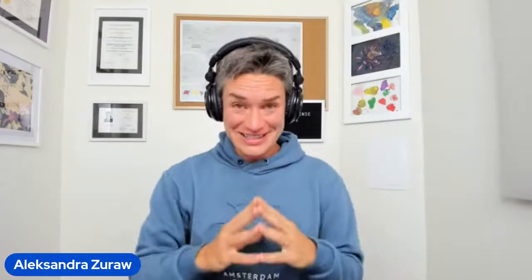Okay, so fixation. The goal of this is to keep everything in the tissue as is at the moment of, and now I'm crying. That's very sad, just joking.